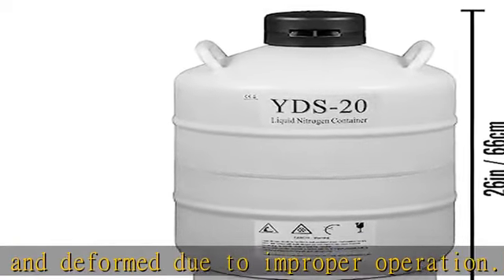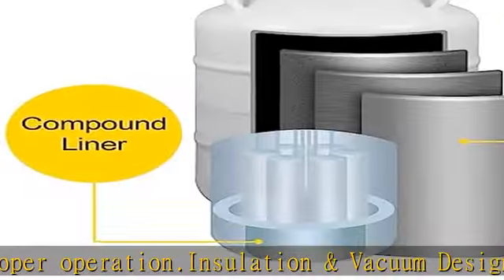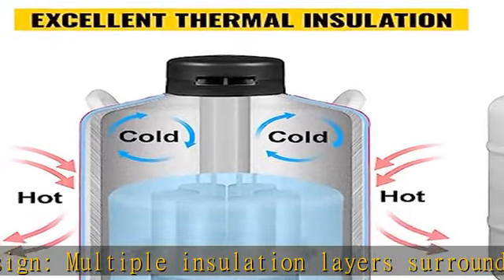Portable protective sleeve: every container comes with a protective sleeve which prevents possible scratches on the surface and impact or damage, and is also ideal for transporting and carrying the tank anywhere you want.